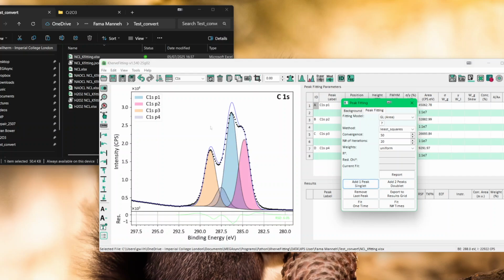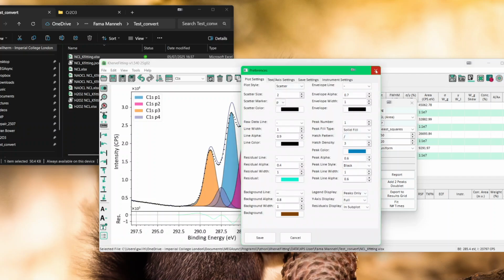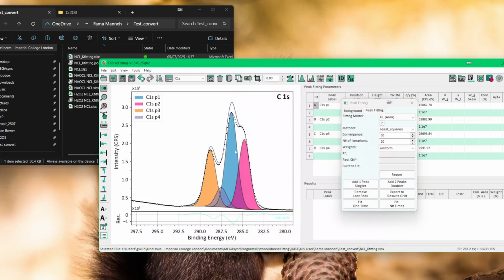And you can see, by the way, the colors are like this. It's because I've said yes to the, oh, I dismissed the registering, so it's doing that. But if I just click preference, the data is coming back. So I just need to make sure I have done that.